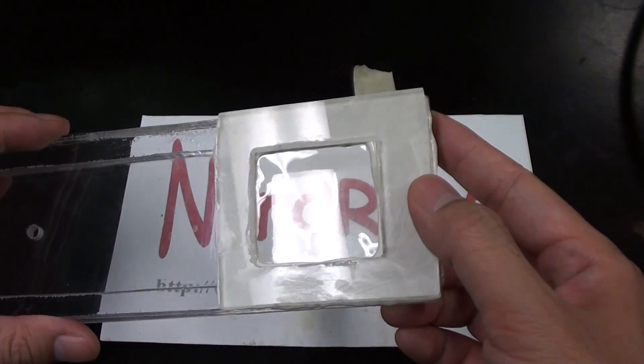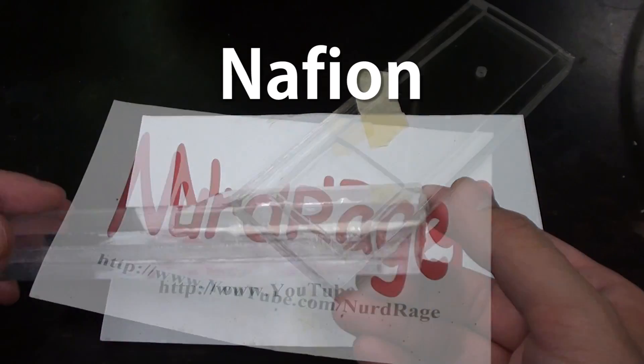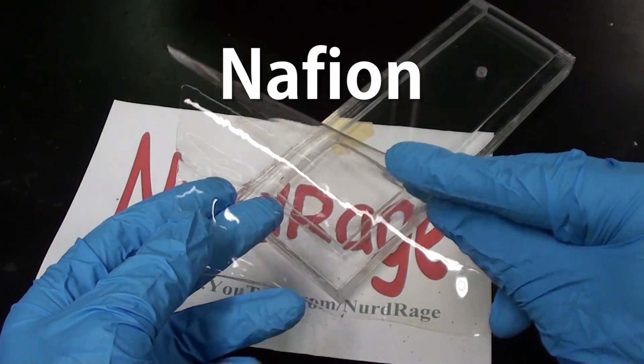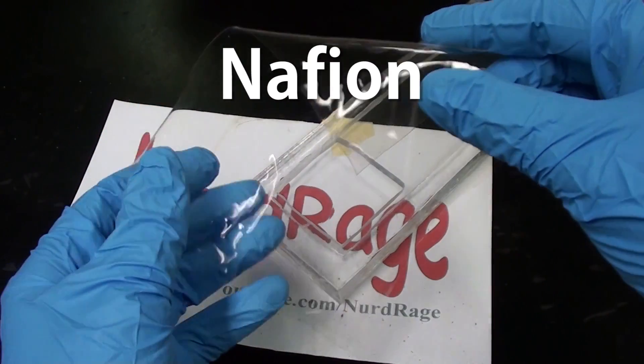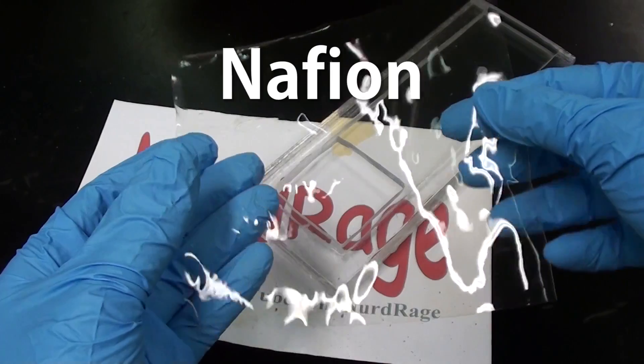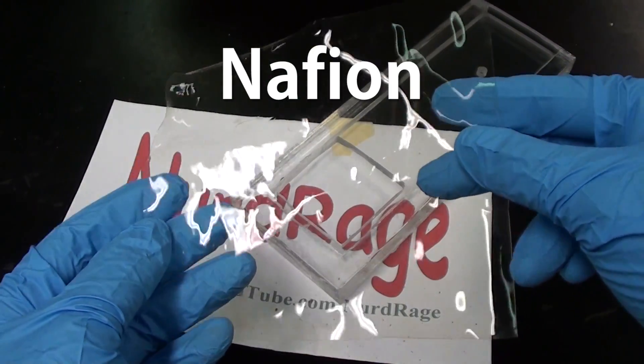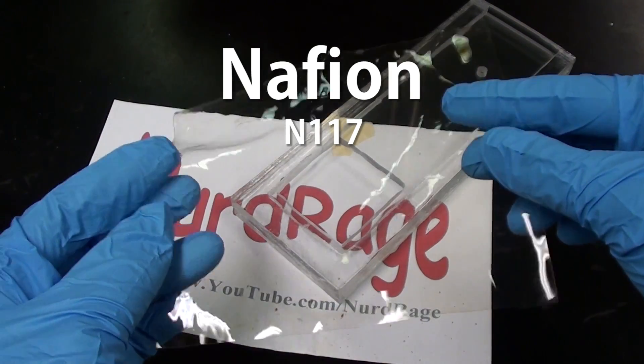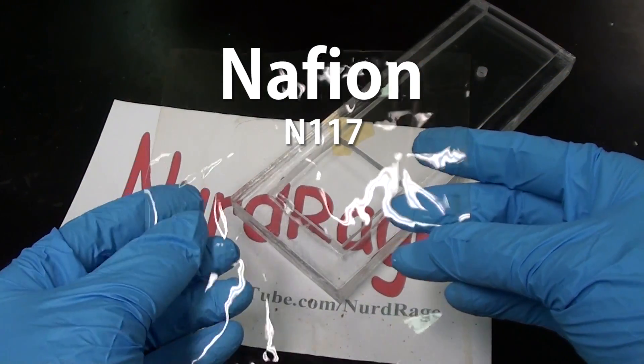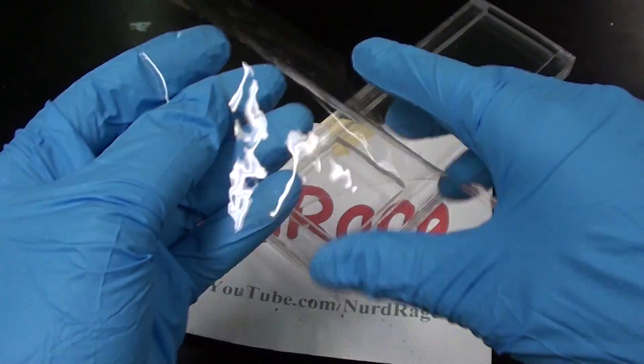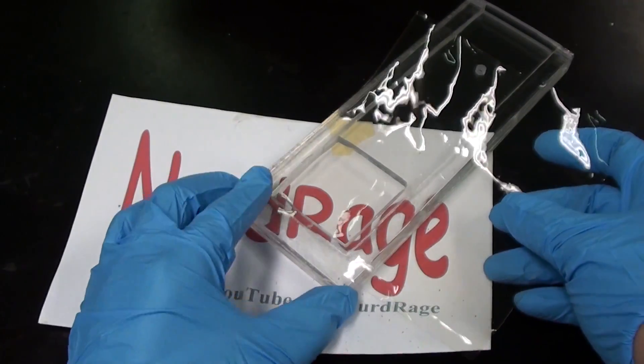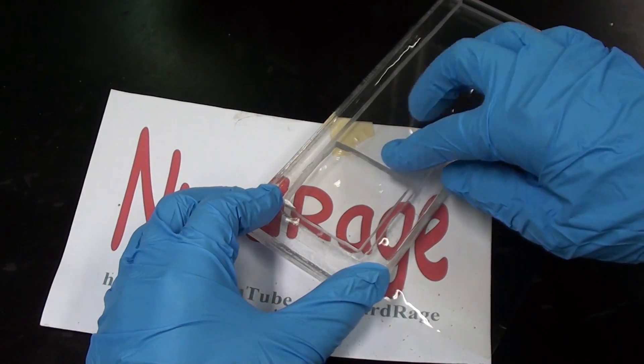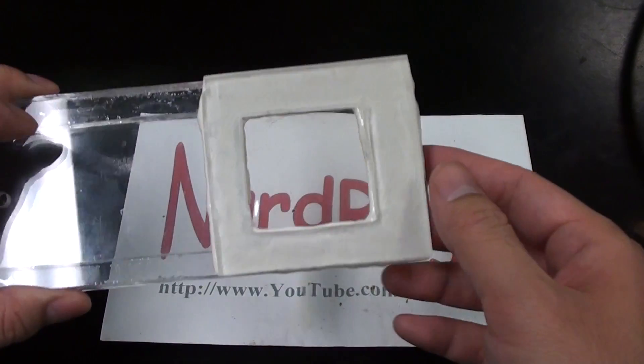There are many membranes available but we'll be using a type called Nafion. Nafion is expensive but because it's used in fuel cells, and fuel cells are very popular these days, Nafion is getting more and more accessible to the amateur if they have the money for it. This particular sample is N117 but you can buy cheaper N115, N112 or even some of the other types. They mostly differ in terms of physical strength, ionic conductivity, chemical stability and so on. And as amateurs we're not stressing them to their limits where these parameters would be a big issue.